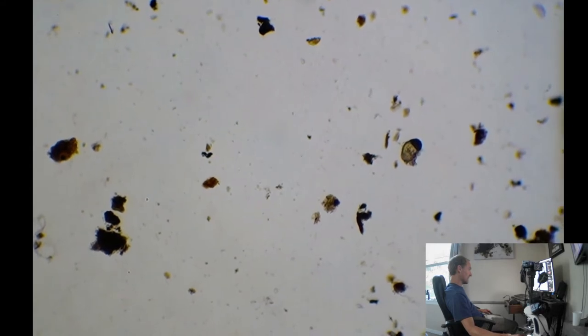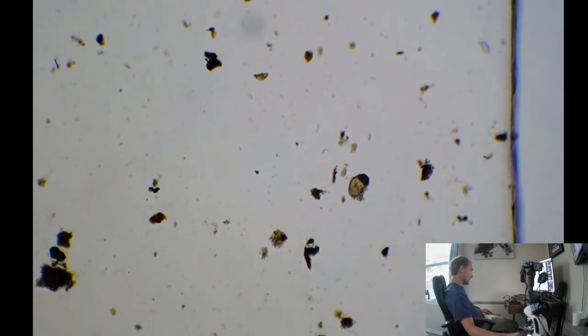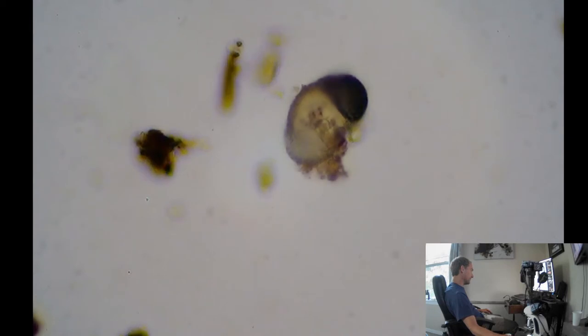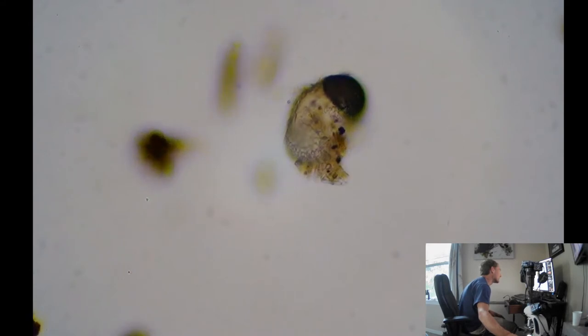Seeing all aggregates. That's kind of interesting looking right there. Let's take a quick spin in and see if this is some sort of cyst or something here. Might just be an aggregate. Adjust the color, get our focus in, and I think it was right over here somewhere. There we go. What's that? It's looking like there's stuff in there. Very interesting looking. Not sure what that is. Could just be some plant matter.